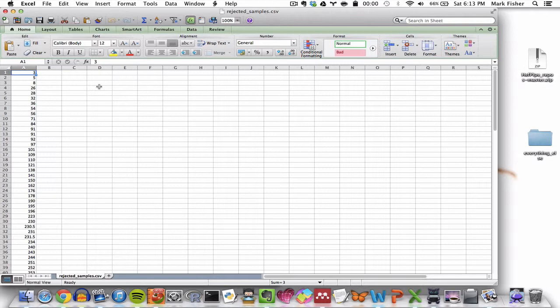By the way, in case you have to deal with triploid samples in your system, triploid scores for loci in keep list, right? So if you end up having 3 genotypes at that locus, it gets flagged by the pipeline as being problematic, and users will be asked to either delete the extra column for that sample in the relevant allele report before moving on, or you can delete the genotype entirely of the offending individual at that locus.